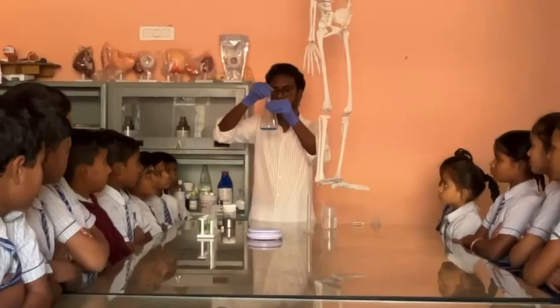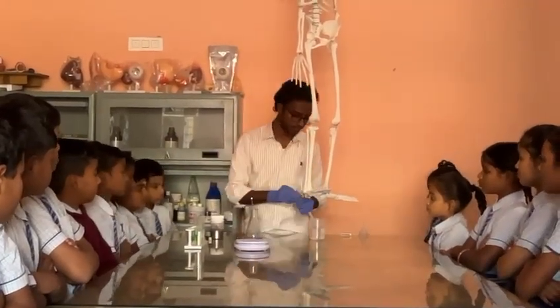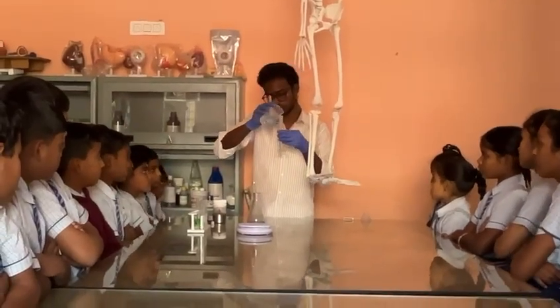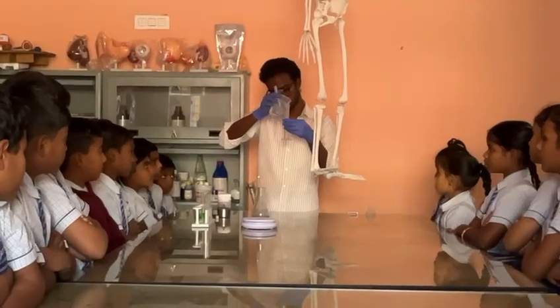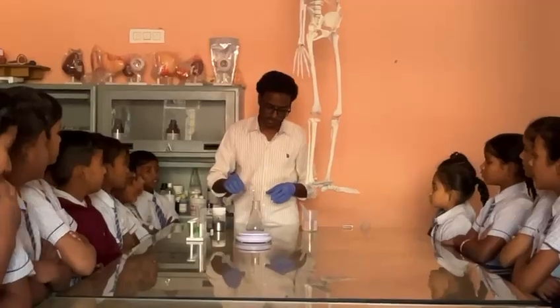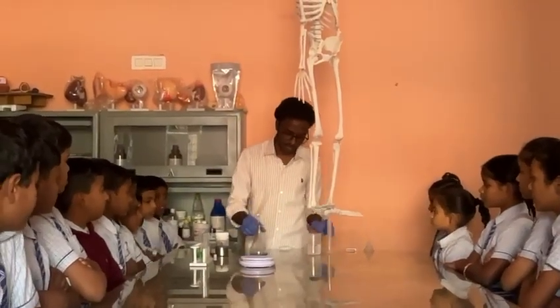It is not getting dissolved properly, so we'll add more water. We'll take 10 more ml of water. What is this? Measuring cylinder. With the help of a measuring cylinder, we can measure liquids.